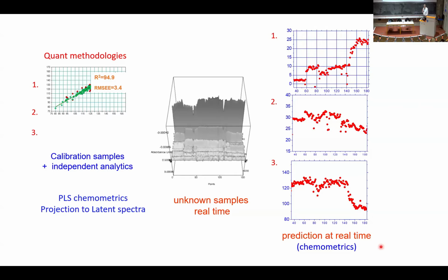Now, think about the hypothetical scenario where you are working for a company that runs a deposit, and they are doing regular analysis of their samples. They measure one sample per shift, 3 samples per day or 2 samples per day, whatever, and they have a collection of samples and independent values measured with their own know-how techniques, quite reproducibly for them. I mean, repeatable for them. They may not be reproducible because others would use some other technique, but they have a set of samples and a set of different measurements. So if I manage to calibrate, to get the spectra of the samples and use chemometrics to link the spectra to the properties, it would look like a calibration up here.